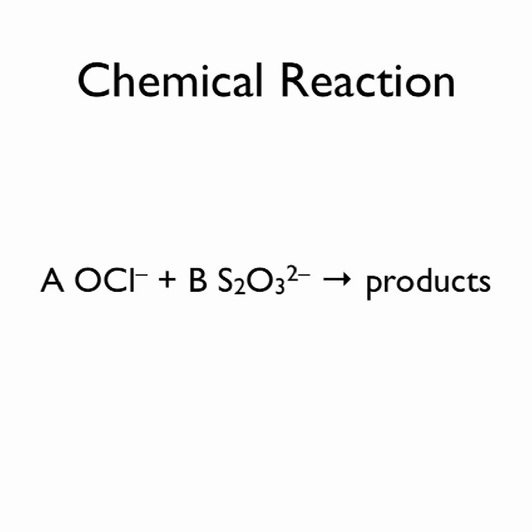You will prepare a series of mixtures of the two reactants. Each mixture will have the same total volume and the same total number of moles of reactants. The reaction is exothermic, therefore the mixture that generates the most heat energy will be the reaction that completely consumes both the hypochlorite and the thiosulfate ions. You will use this mixture to establish the coefficients and therefore the mole ratio for the reaction.